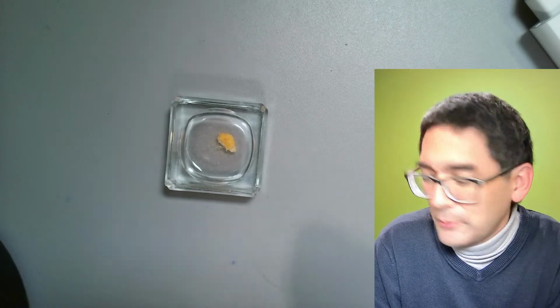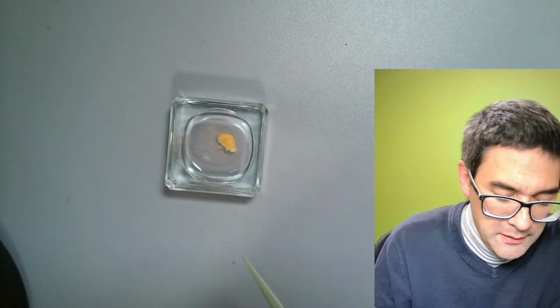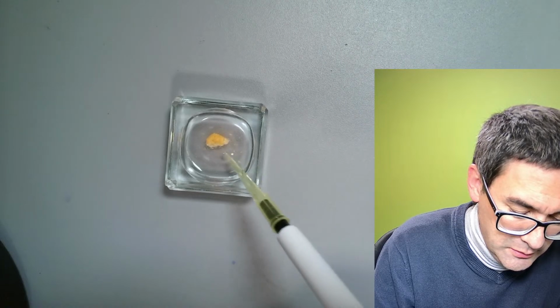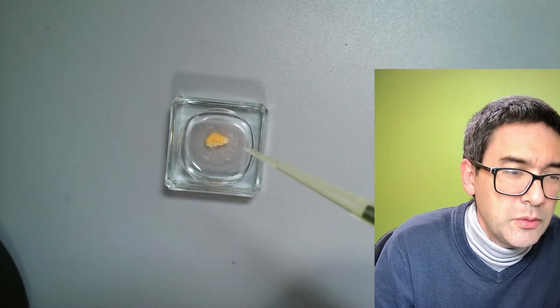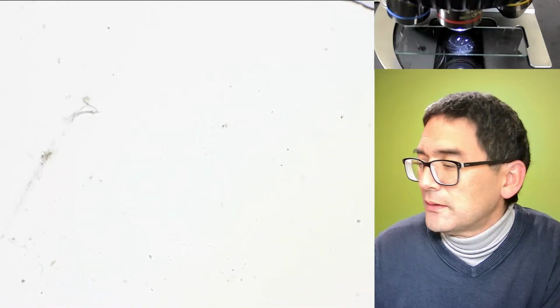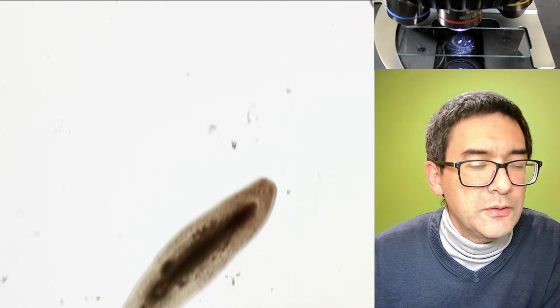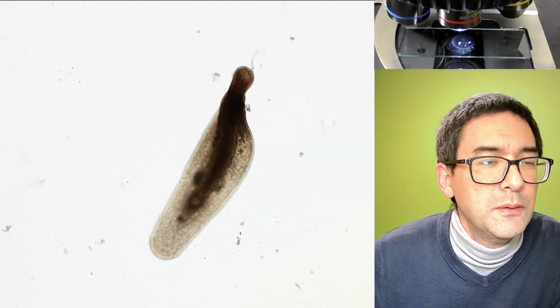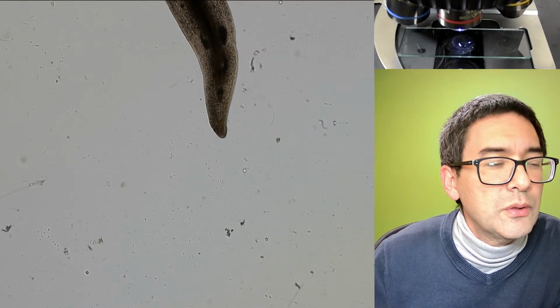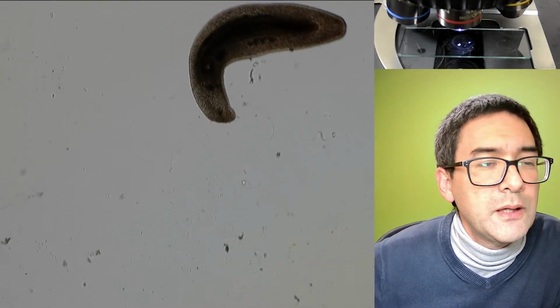Okay, this is a fresh pipette, and maybe I'm just going to go a little bit in here, and I'm going to take a little amount here. And I'm going to now change over to the microscope view. Let's have a look, here it is, the flatworm. Then let me close the condenser a little bit more. There are not so many other microorganisms around.